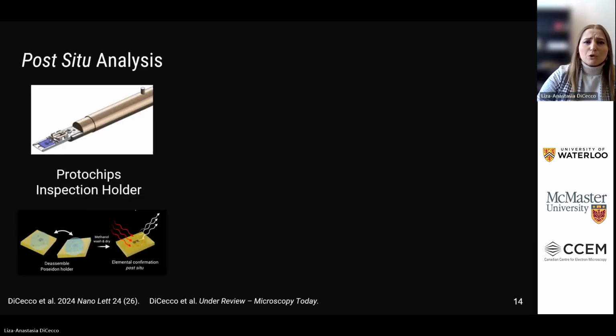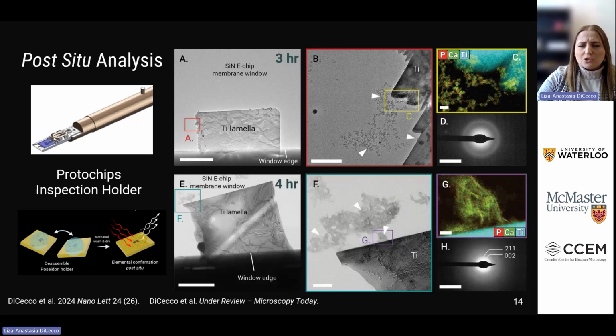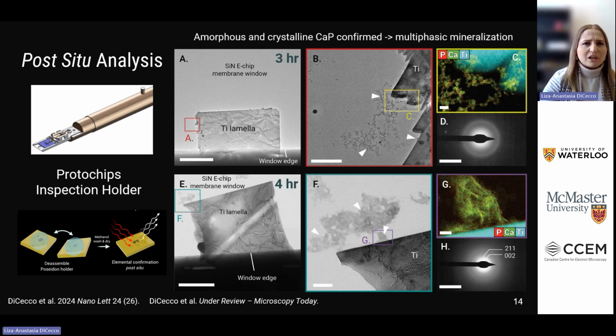This is exploratory work, but I think that this could be some really exciting work in future to continue on. For post-situ analysis, this is facilitated using the Protochips inspection holder. And so we did some post-situ. Here's 2 of the lamellas reproduced. And we highlight that we could do some really nice EDS showing that the calcium phosphate minerals are present, and do some diffraction analysis as well. And what's interesting is we are seeing some amorphous and crystalline calcium phosphate mineral attaching to these surfaces, and this relates more relevantly to biomineralization mechanisms, and we're highlighting that there are some multiphasic pathways here.